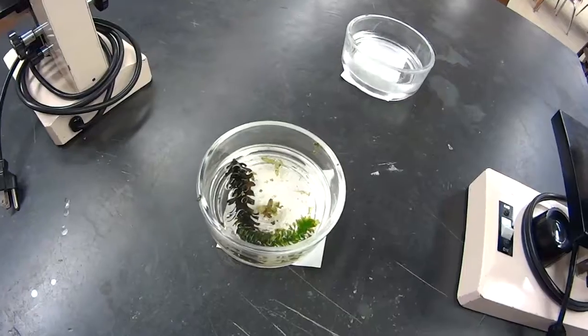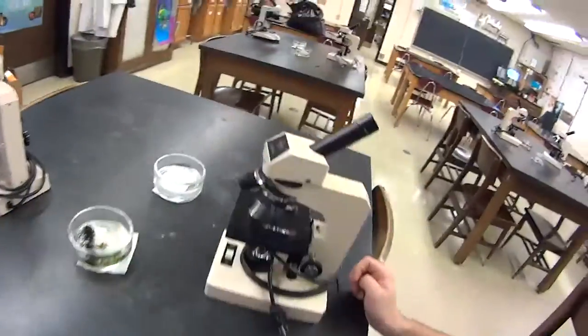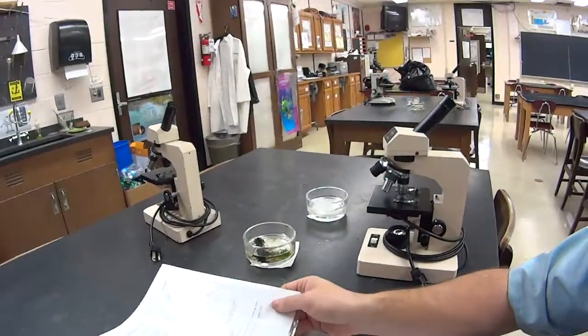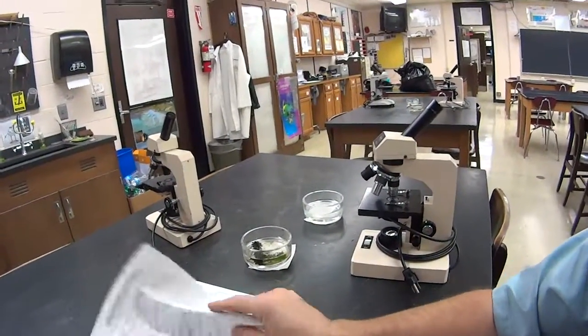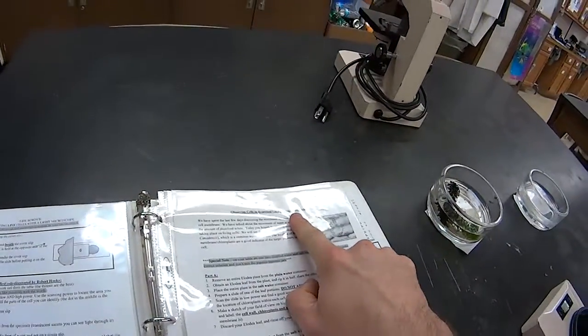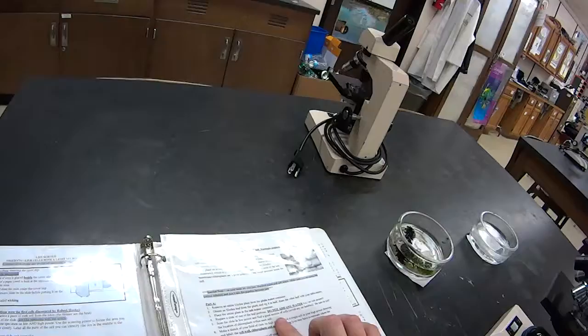Notice that your elodea is starting in the pond water. So on your paper, we're going to do part A first. How do you know what to do for part A? The lab binder. So you're going to flip it open. You are looking for this lab right here — observing cells in hypertonic and hypotonic solutions. So that's for part A.